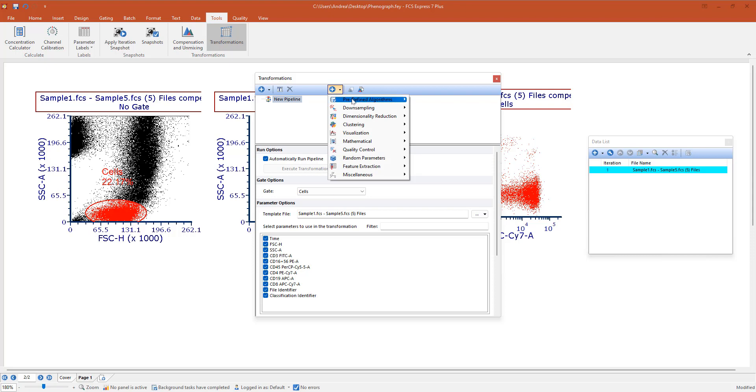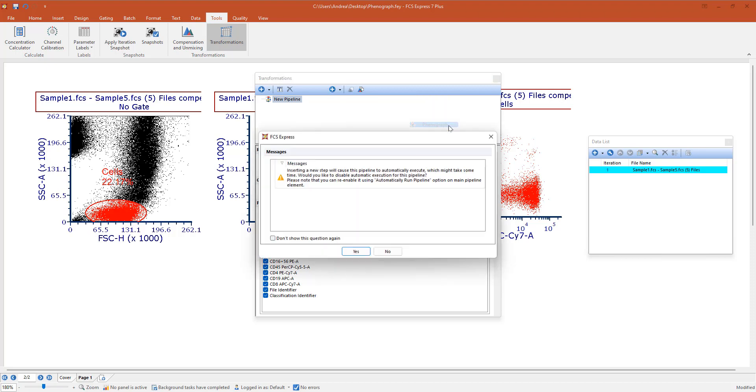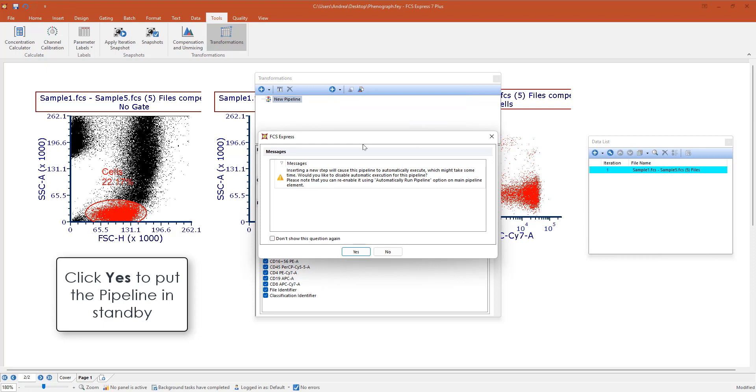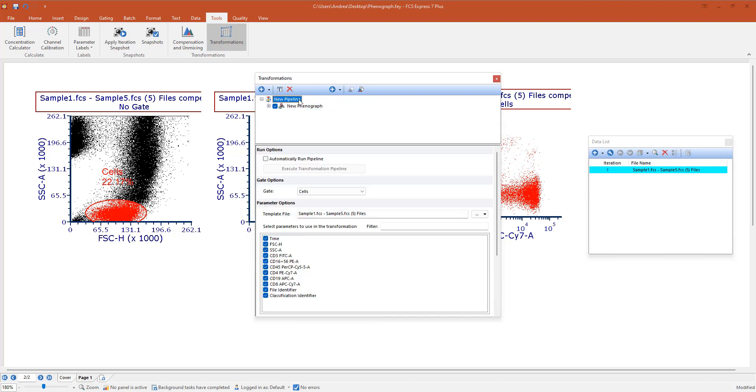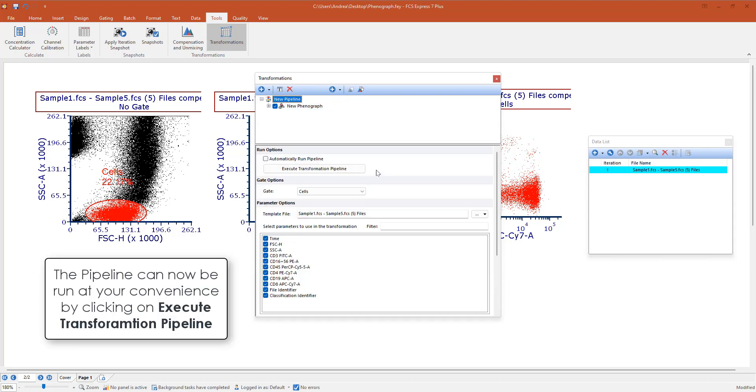For Phenograph, you can go to predefined algorithm and create a Phenograph. FCS Express will prompt you about disabling the automatic pipeline running. This means that if you disable this, the pipeline will be in standby and you will be able to run it at your convenience by pressing execute transformation pipeline.